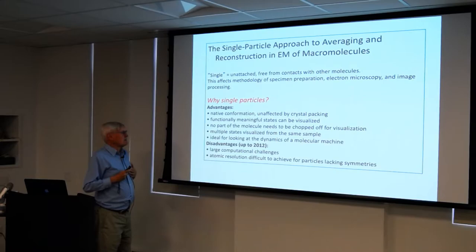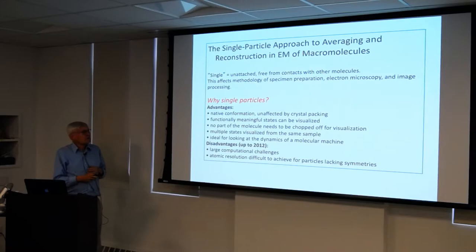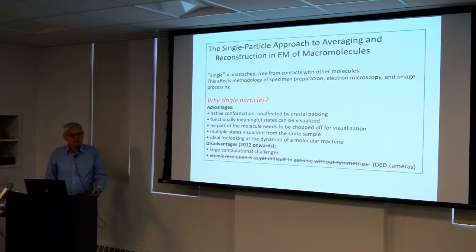And a disadvantage up to 2012 was that the computational challenges were very large, and atomic resolution was difficult to achieve. And this is all gone. Computational challenges are still large, but now we have GPUs, we have specialized code that is already hardwired, and so this is no longer a problem either.